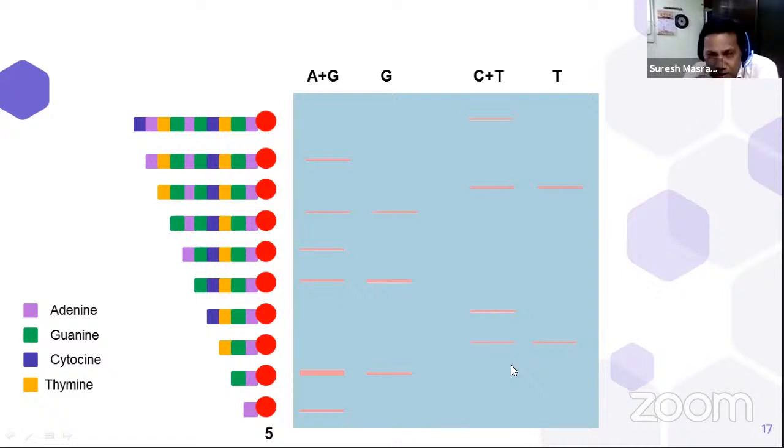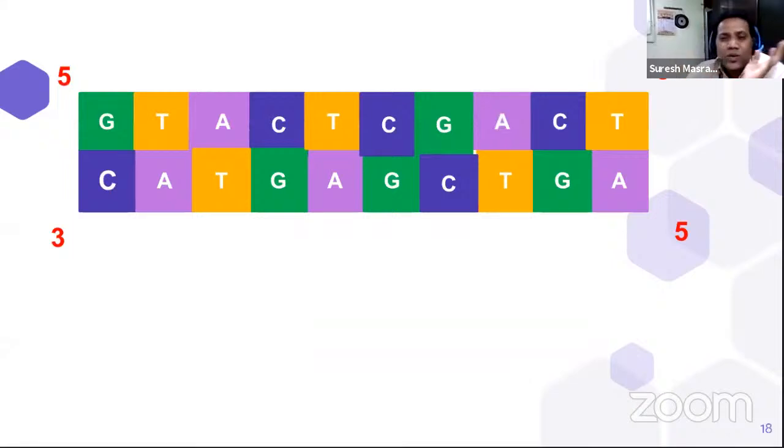Now, likewise, we go on analyzing this electrophoresis gel plate or X-ray plate, and we could analyze this sequential DNA fragment.